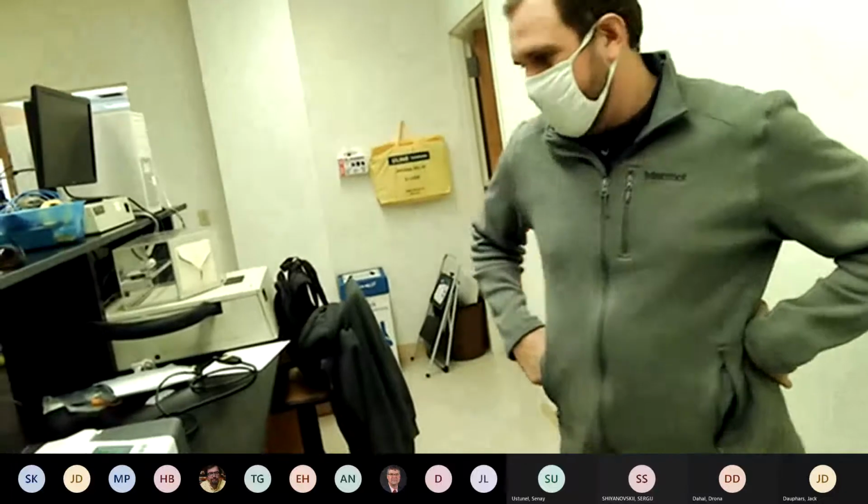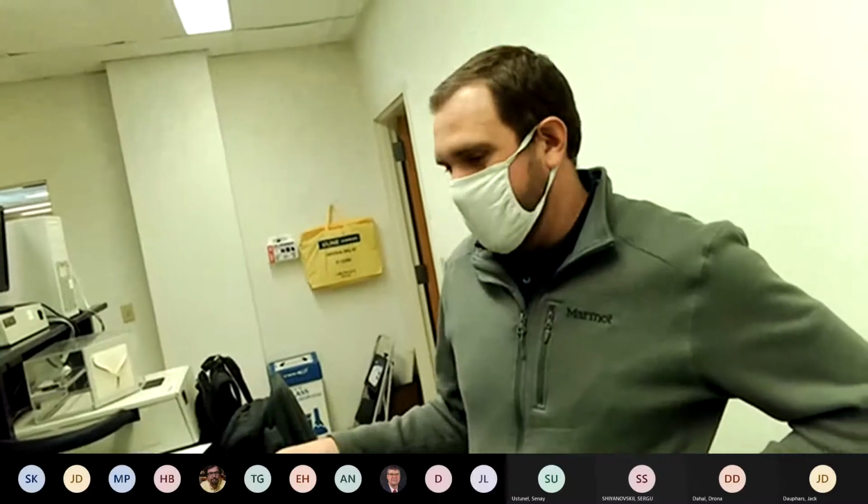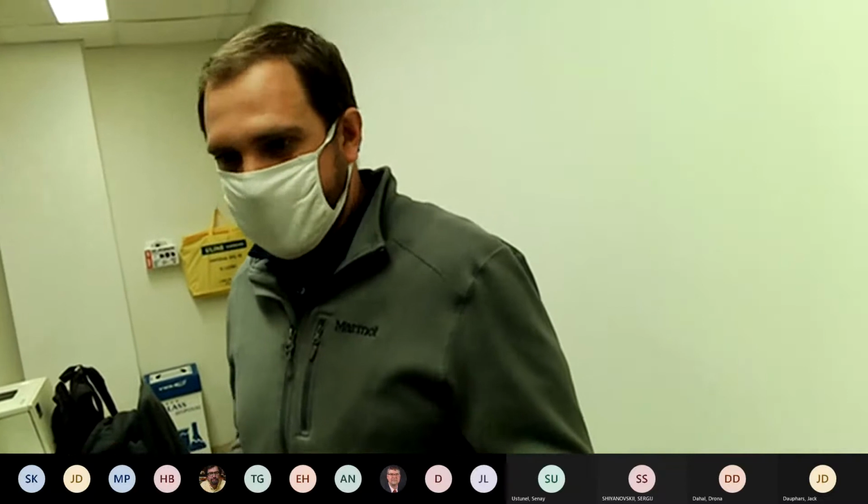Sorry, just a disclaimer before we get started. The screen is very small on the instrument. We were just working to get it hooked up to the computer. You can run it off the computer, which is much easier to see, but we were having a few issues with that, so we probably need another 15, 20 minutes. So we'll get that going after this demonstration.